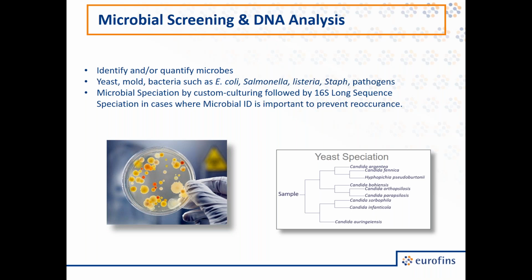Oftentimes, we can then pinpoint where in the process the contamination came from. Was it a raw material? Maybe it's in a water source. Maybe it's ineffective cleaning or sanitation. And corrective action can be taken to gain control of the process.